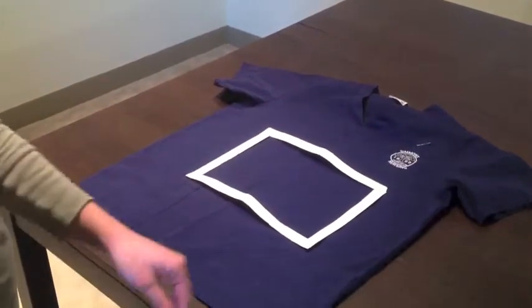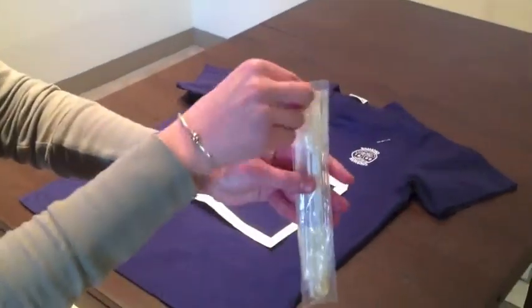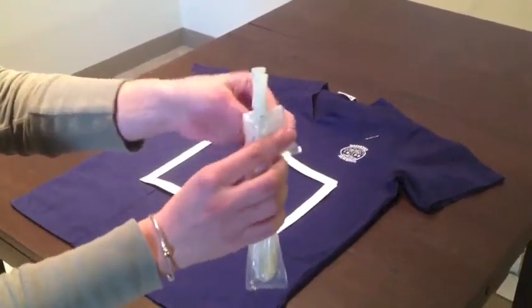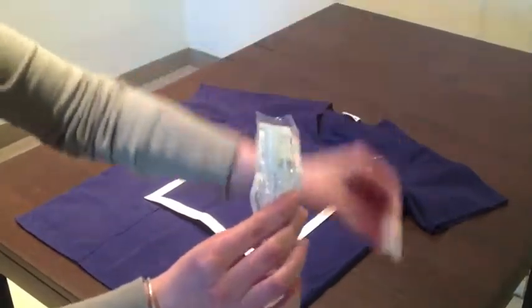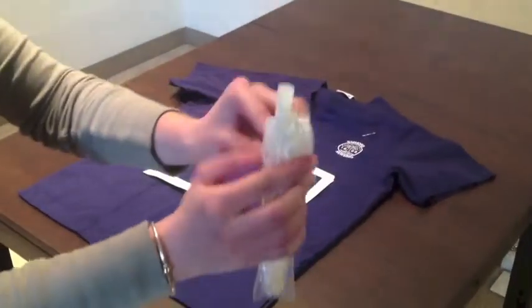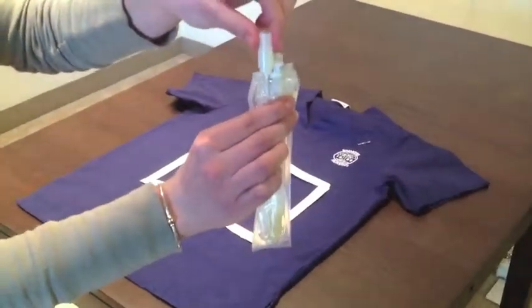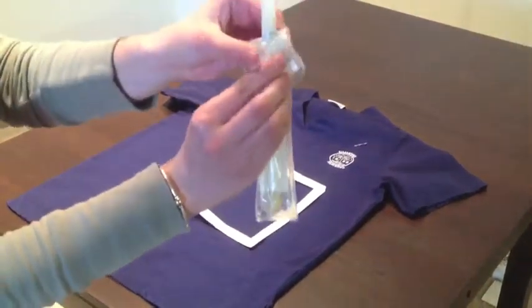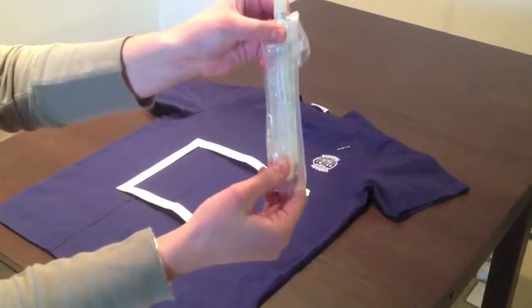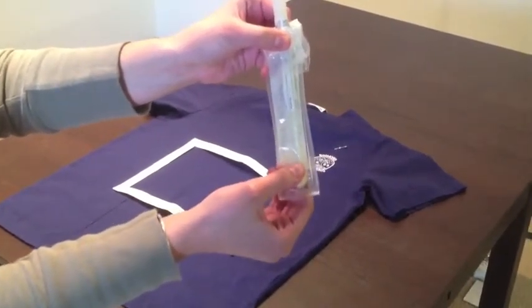Remove the swab from your supply bag. Peel back the packaging about a quarter of the way. Remove the sterile cap from the plastic tube and discard. Holding the swab only by the plastic cylinder on the end, insert the swab into the plastic tube.